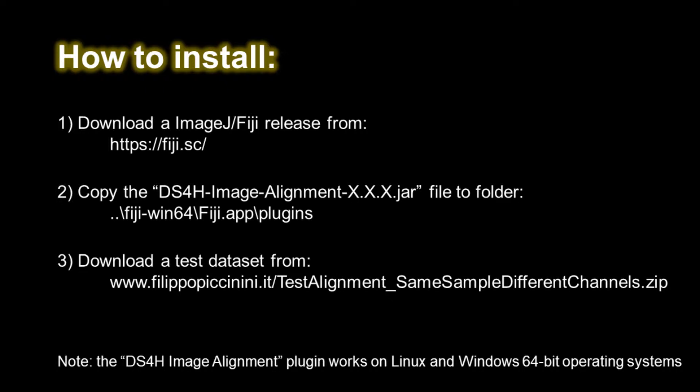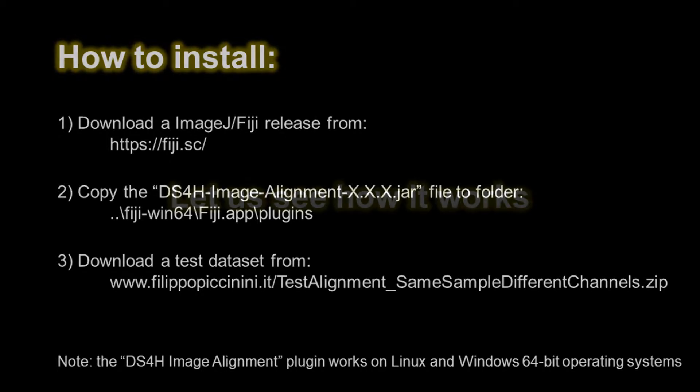Please download all the sample data sets we provide to follow this video tutorial and do some experience using the tool before analyzing your own data. Just one additional note. The Image Alignment plugin is implemented in Java and works on Linux and Windows 64-bit operating systems.